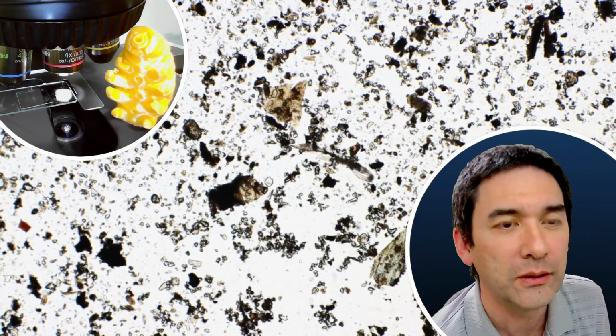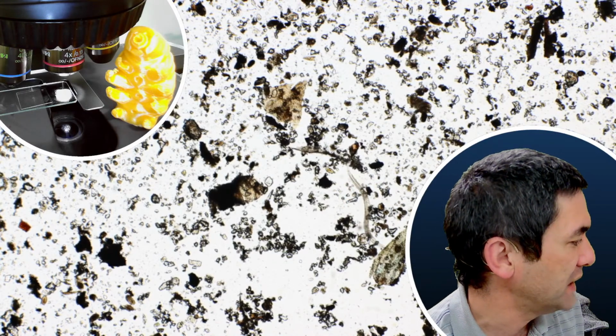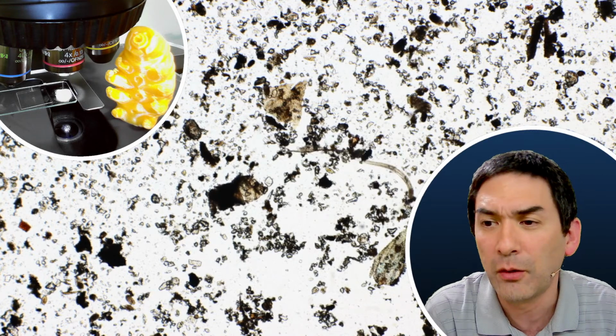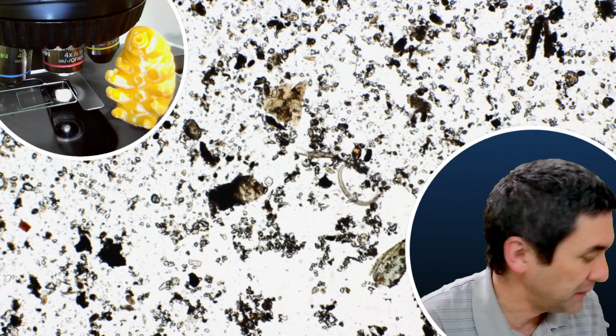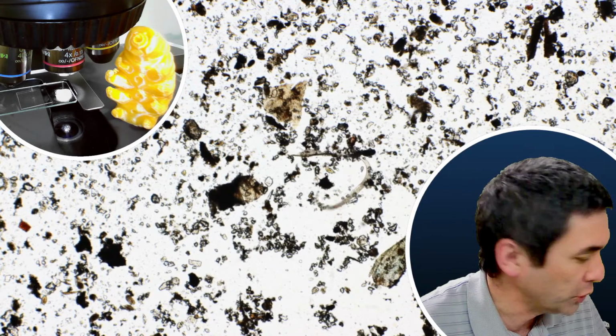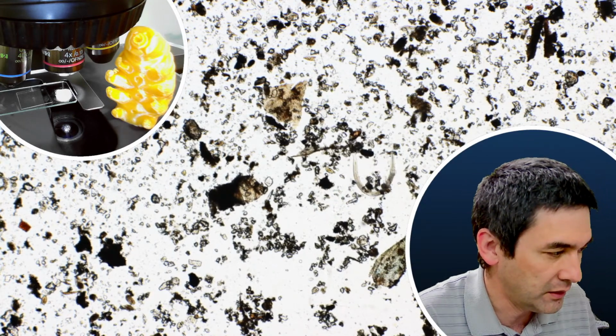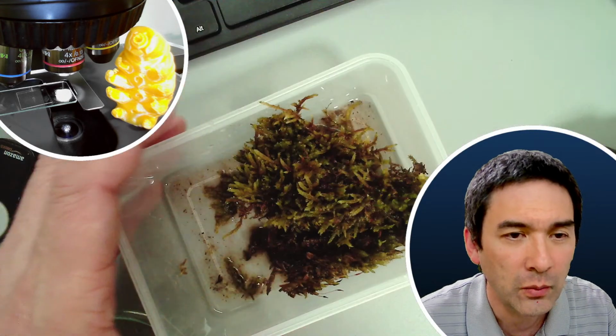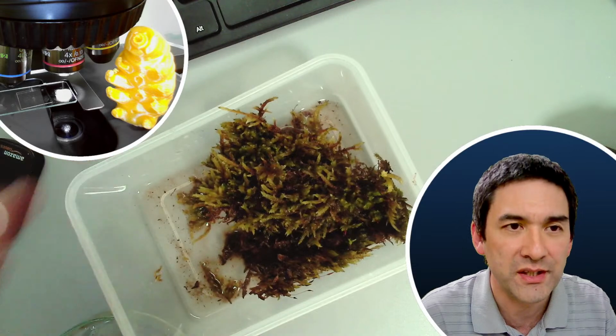If not, then I do have a couple of other water samples as well that I can look at, and we're going to see how it goes. So if you want to find tardigrades, I'm going to show you what I got here, and how I like to collect them, and then I'm going to also show you the publication where it was first described. I collected a moss sample here.